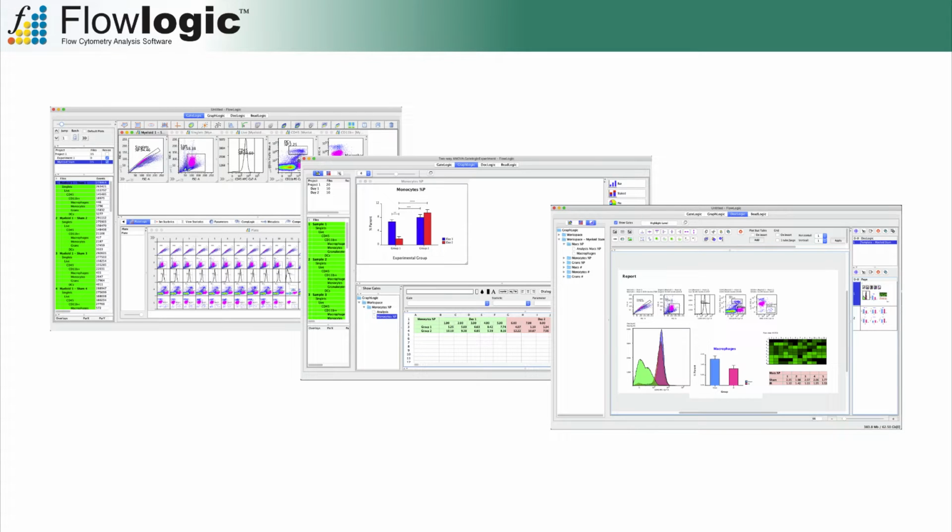Thank you for joining me for this FlowLogic 8 webinar. In this demonstration, I'm going to give an overview of FlowLogic and demonstrate a typical analysis workflow.